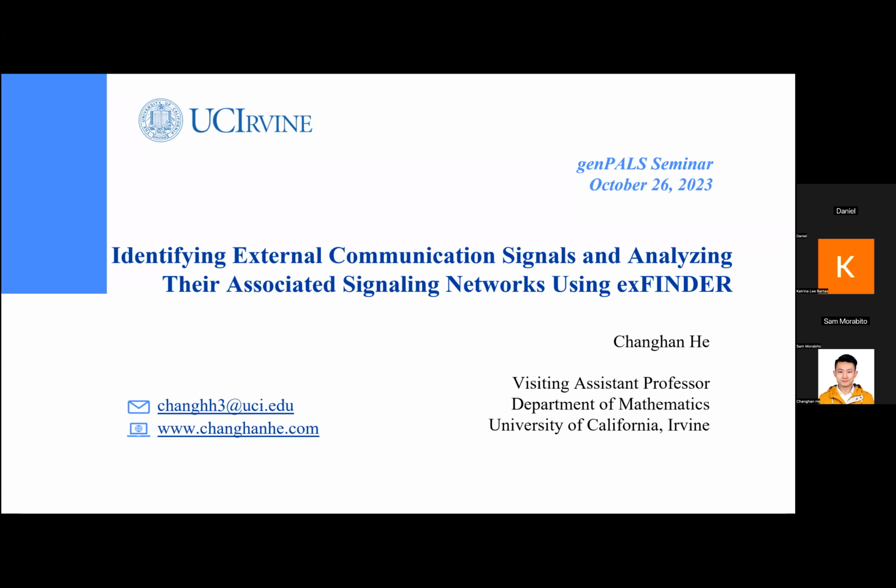The title of my talk today is identifying external communication signals and analyzing their associated signaling networks using exFINDER.